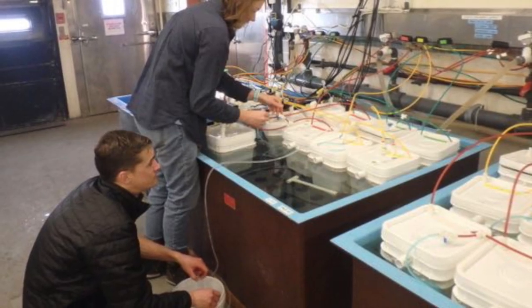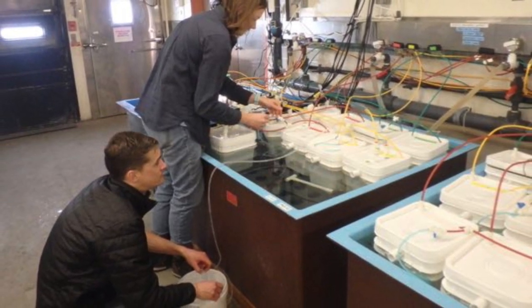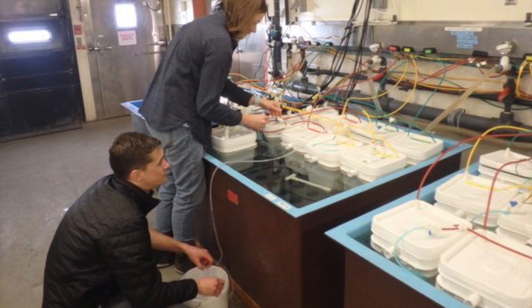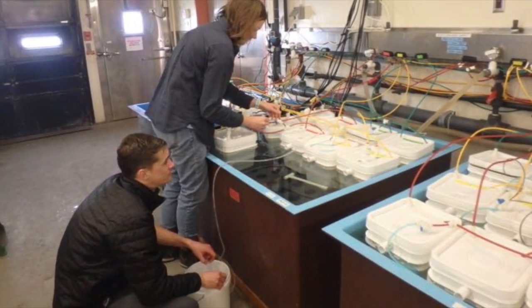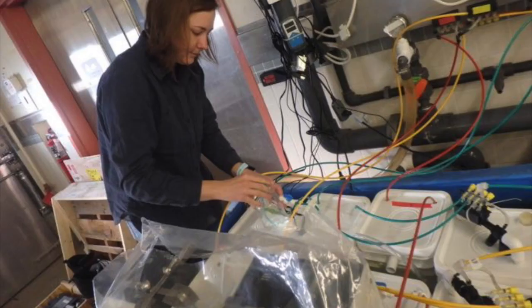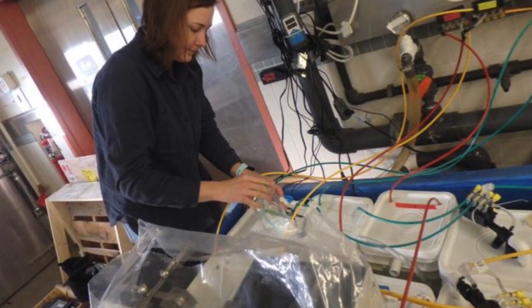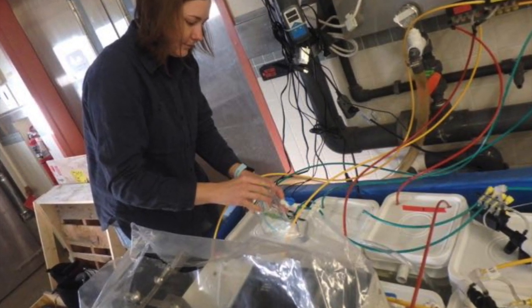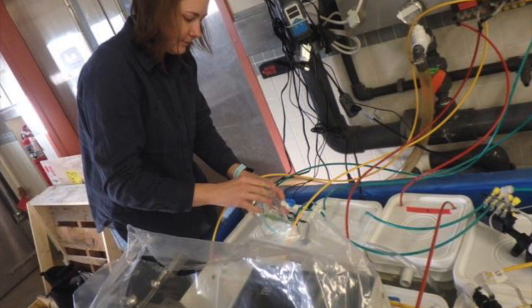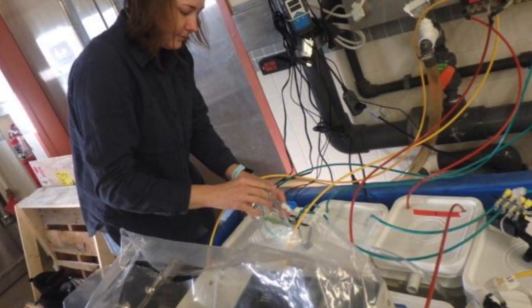Andrew and Mandy are collecting water samples to be used to determine the level of carbon dioxide. Calculating this is not nearly as easy as the temperature. Water samples are taken to the lab where they are run in 2 separate tests. First, they test the pH of each sample. The pH tells how acidic the sample is. Acidity is determined by the percentage of molecules that have their hydrogen ion separated from the ionic bond.